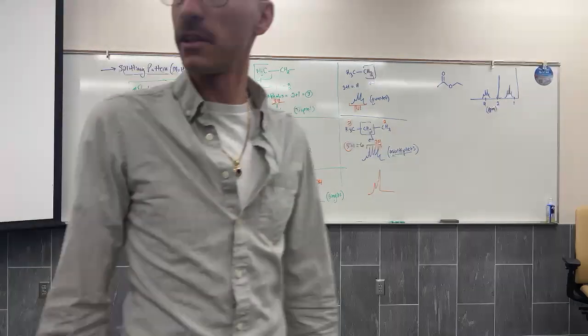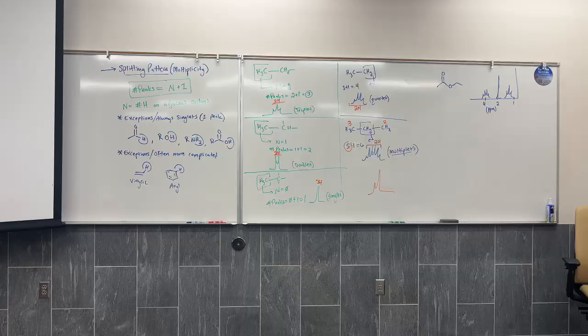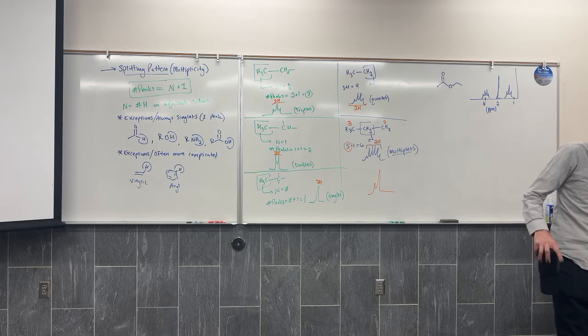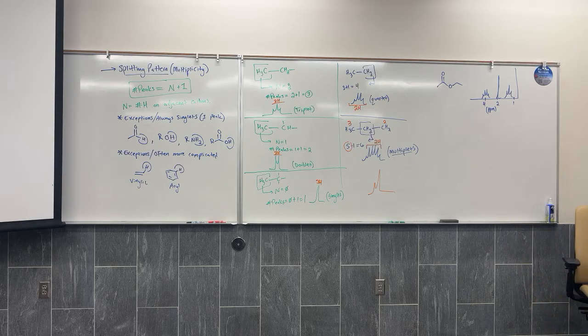So you can do the next one? That's what we're looking at. Although the next one's not as clear, I can't tell if it's 2 peaks here or 3. I'd go to the one after that. Okay, go to the far right one. You guys got it?